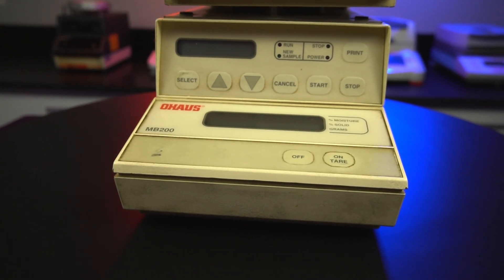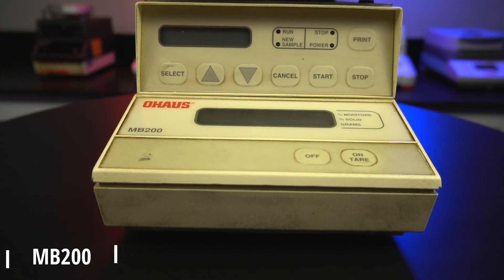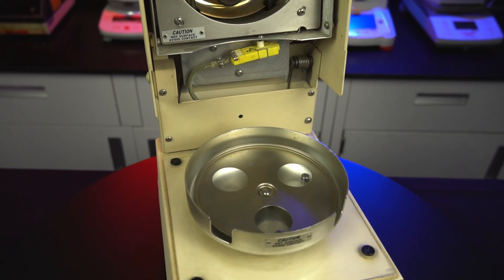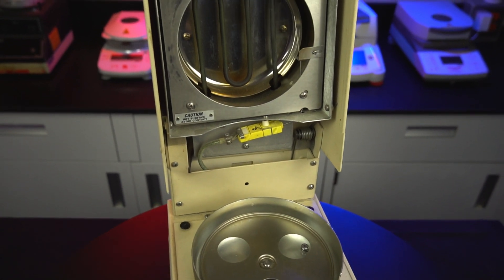The successor to the MB-301 was the MB-200. Released sometime in the 90s, it is the last to have this giant disc tray and the first to use an infrared heating source.